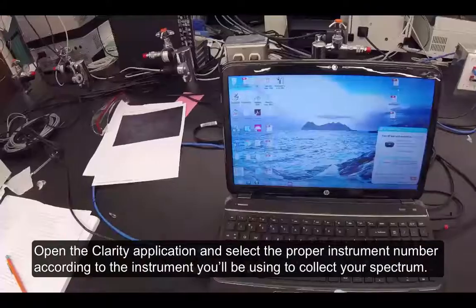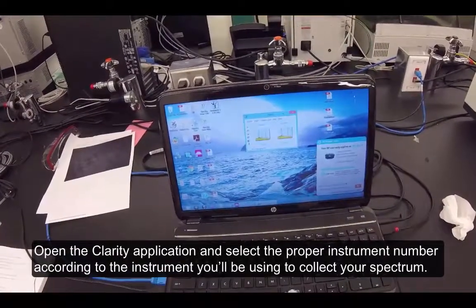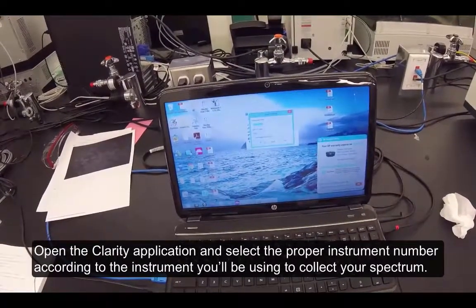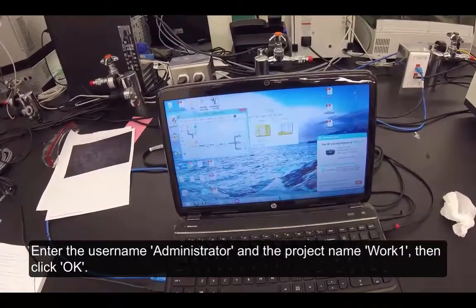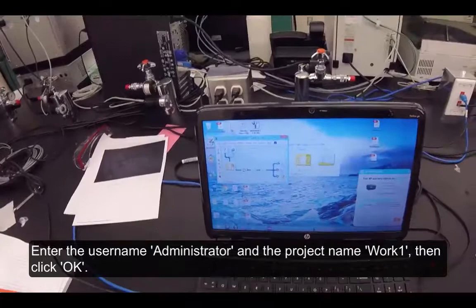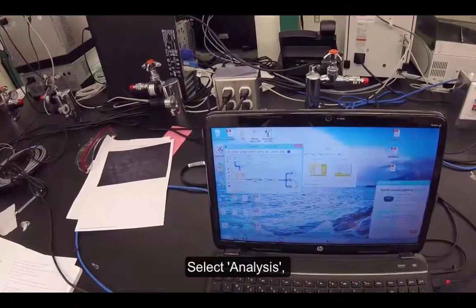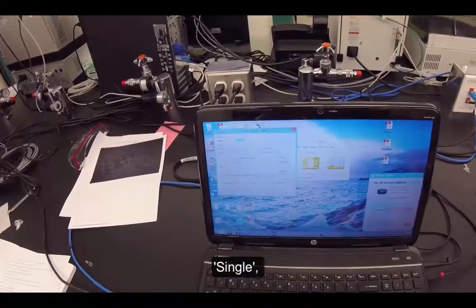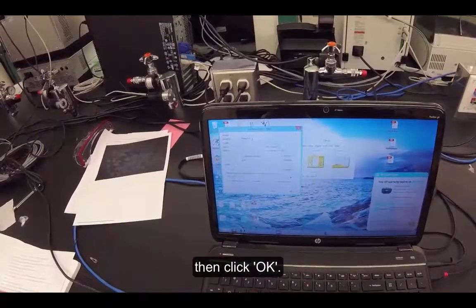Open the Clarity application and select the proper instrument number according to the instrument you'll be using to collect your spectrum. Enter the username Administrator and the project name Work1, then click OK. Select Analysis, Single, enter your sample ID, then click OK.